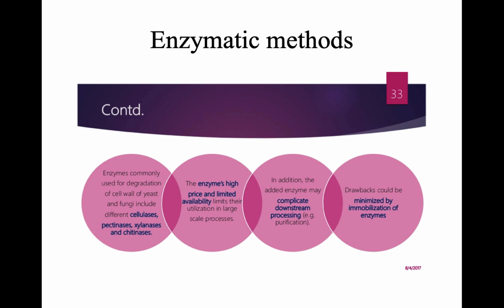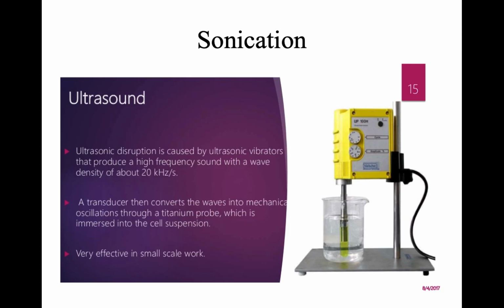By using these enzymes, we are able to clear the cell wall. The cell wall is removed, and now the cells have only the cell membrane, and these cells can be ruptured easily with the help of any osmotic shock. So this is the case with enzymatic methods.